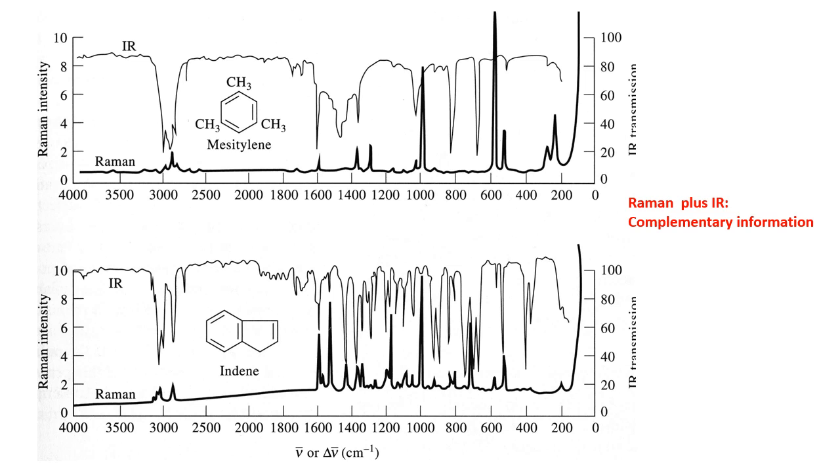Raman spectroscopy is complementary to infrared, so you can study the same fingerprint area with a slightly different picture. You can see that in the Raman spectrum, here and there, you have dozens of peaks of different intensity, and they can serve as a fingerprint of your compound, even if this compound is relatively simple.